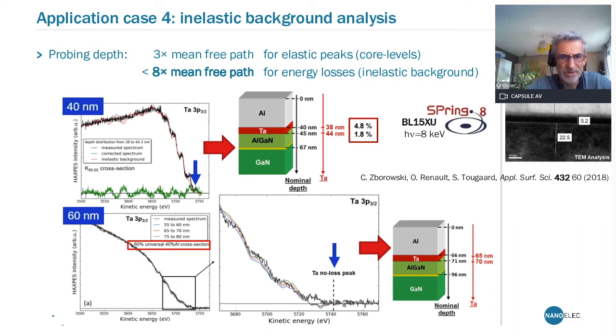You see on the tantalum spectrum acquired at Synchrotron SPring-8 in Japan that actually the elastic peak, displayed with the blue arrow, is no longer visible because the tantalum is heavily buried.